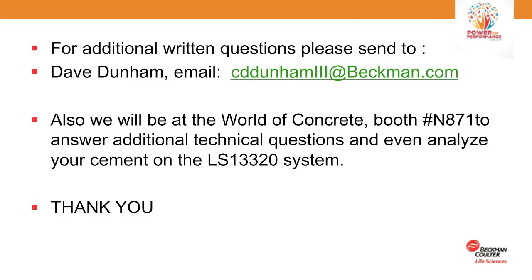Miguel asks, what is the life of the sensor? Typically, these are solid state lasers, so they can run, depending on its use, if you're operational 24 hours a day, you're probably talking 8 to 10 years.